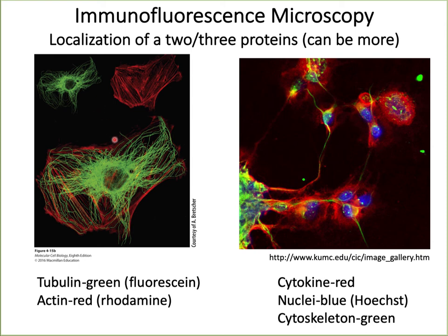Say for example, we just saw the example in the schematic diagram, and this is a real picture. The top left panel shows the fluorescent stained tubulin, which forms the microtubules in the cell. The top right is a rhodamine stained actin, which forms the microfilaments of the cytoskeleton. You take this picture and this picture separately, and you merge them to see this. So the lower panel shows the electronically merged image.